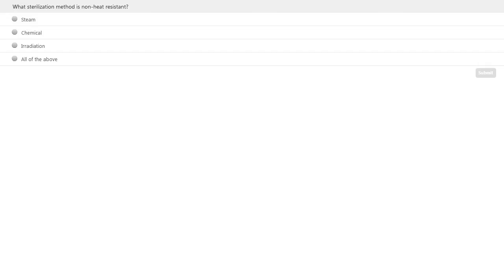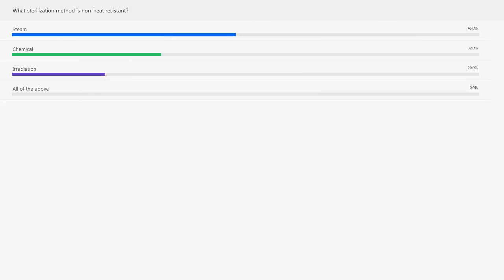Okay, let's take a look at the results here. It looks like there's no one clear winner, Jeff. Steam seems to be the winner. And Michael, it is steam sterilization, and for the audience, I kind of tricked you with the wording of that. I can see how it can get a little tricky.